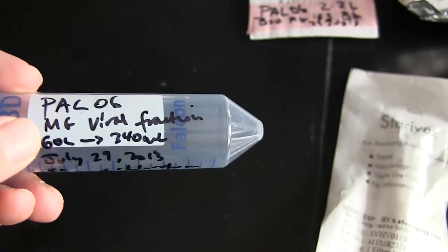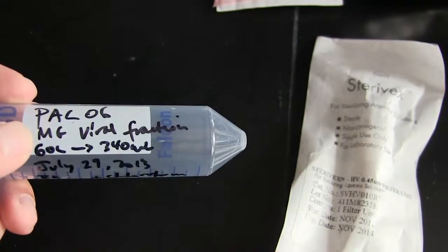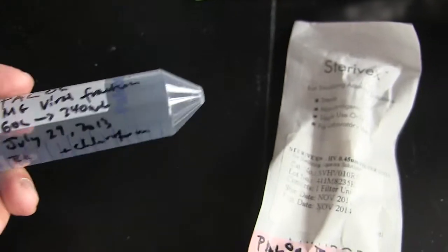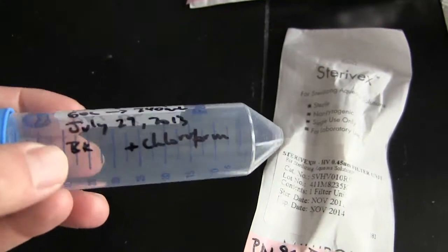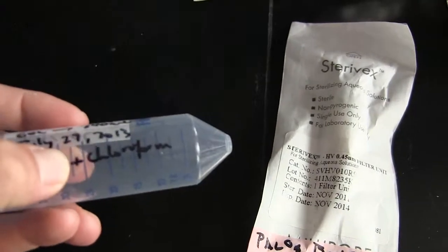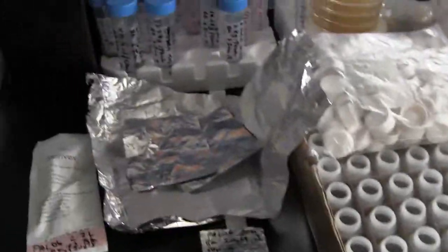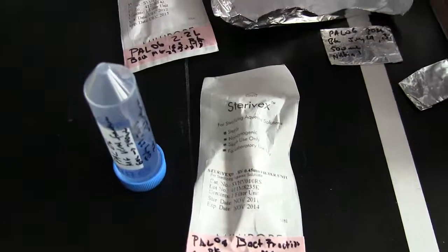Then on your viral fraction, you once again write the date, the site, then viral fraction of the metagenome, then the volume that was concentrated down and what it was concentrated to, the date, my initials, and the fact that I added chloroform, so we can make sure that we handle this sample appropriately. Alright, so that from start to finish on a normal water chemistry day and a viral and a metagenome day, all covered.